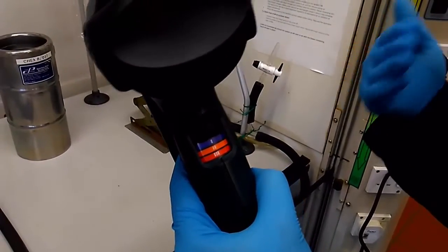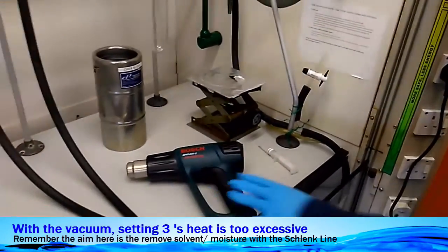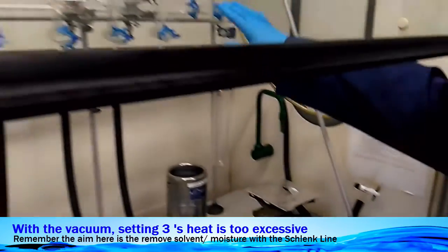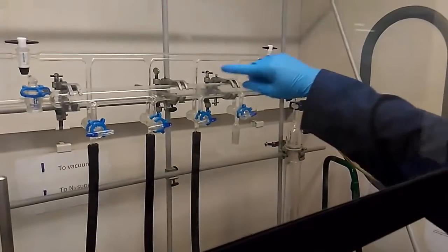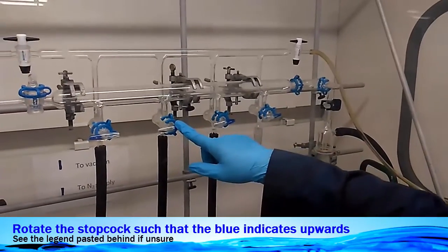Setting 3 is too hot for our experiment, and setting 1 is not enough. Here you see the Schlenk line with the vacuum and the nitrogen, and here you see the two-way manifold.